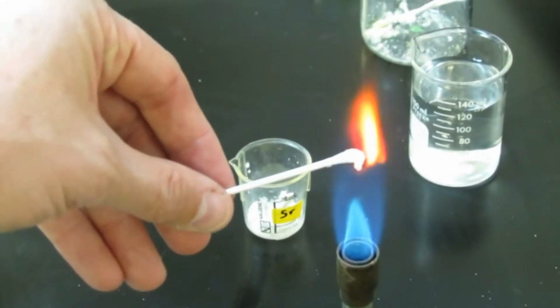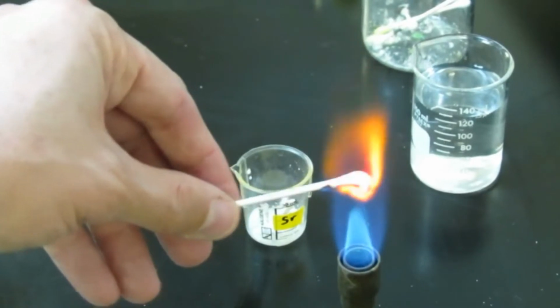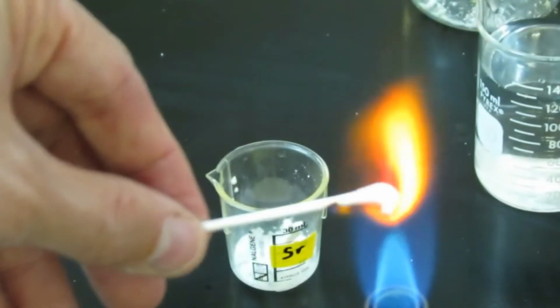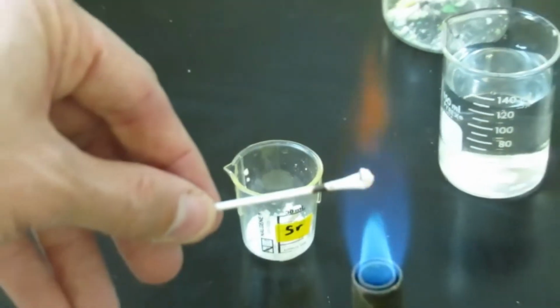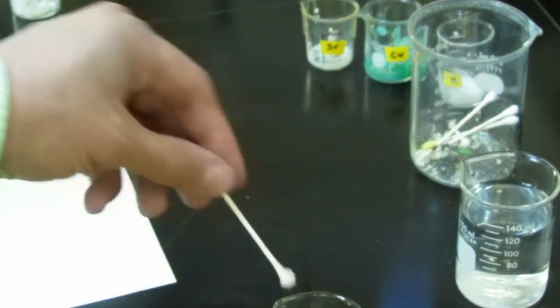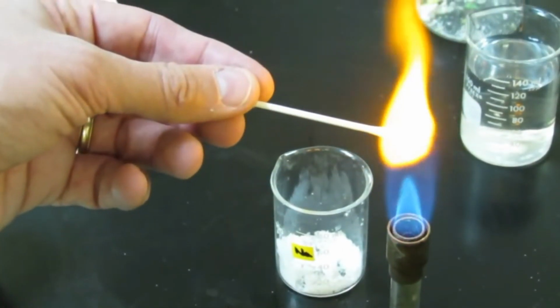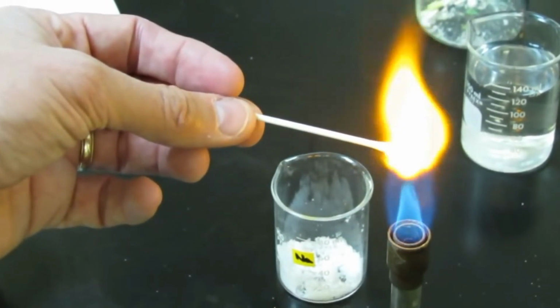And once again, I don't know how well these colors are showing up on the video. It's enough of an observation for you to determine the color for the strontium salt. Okay, we're finished with that. Place that in our waste container. And it looks like we'll move on to sodium next. Take our new cotton swab, dip it in our distilled water, touch that to the surface of our sodium. You can see we have some sodium salt on that tip. Put that in the flame, and we get another color there.